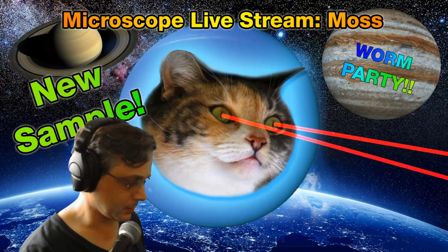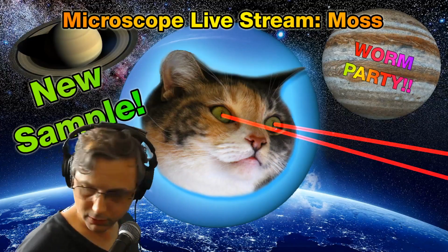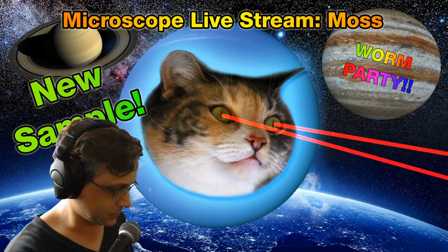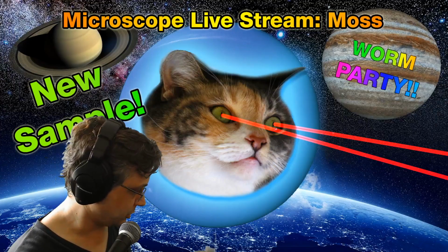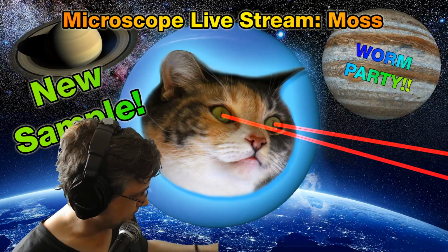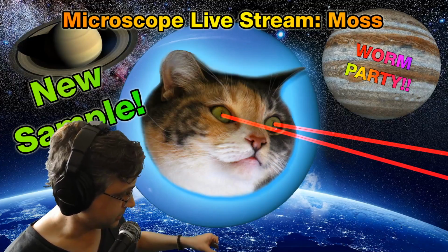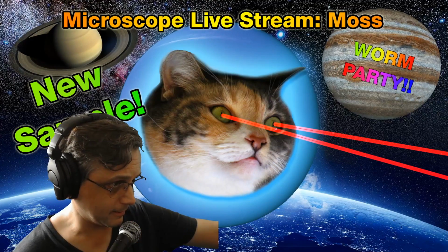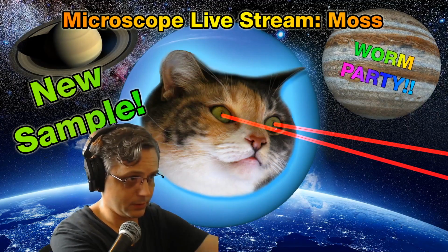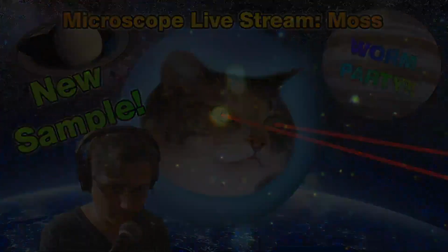We did not get any solid material in the sample. It's all water, no moss. But when you look at it, it's slightly green. And when we looked at it yesterday, it was full of rotifers and golden algae. So let's see if they're still going in here. Here we go. And there they are.